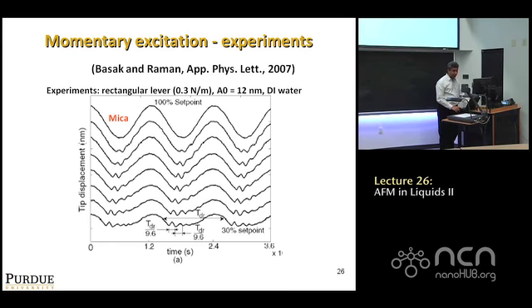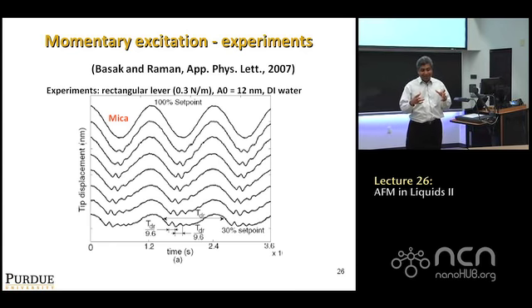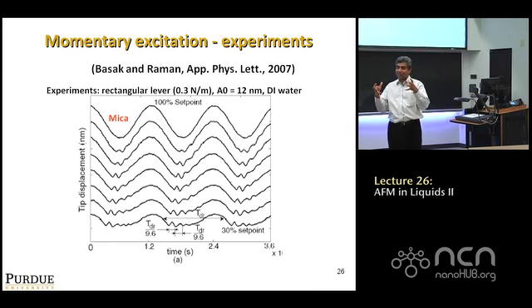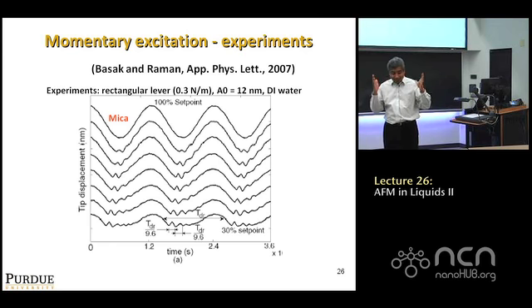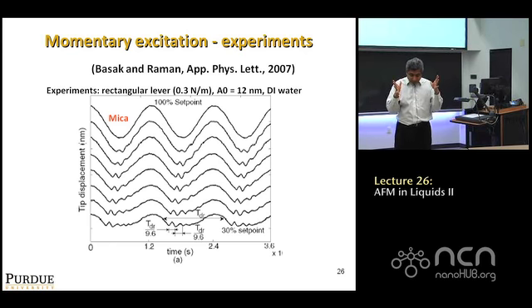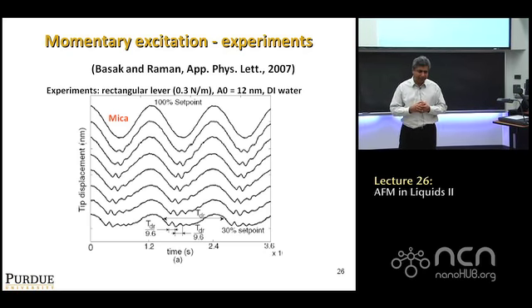You can do other tricks. Instead of looking at the second harmonic, remember the phenomenon I talked about, that when you tap, you make the second harmonic ring. If you want to map local properties of samples, you can imagine the following experiment. Let's say you've got a basketball in your hand and you want to map the properties of the surface, the table, the carpet, and so on. Being very simple, one way would be to let the ball go, let it hit, and see how high it bounces back up. I can look at total energy loss, since during impact it's lost energy. When I do it on the carpet, the basketball doesn't bounce back as much, which means more energy is lost during a collision. I do it on a hard surface, on concrete, and it bounces more. That is one intuitive way, and that's connected to energy dissipation, and to phase contrast also.